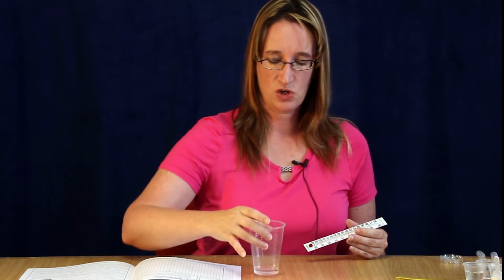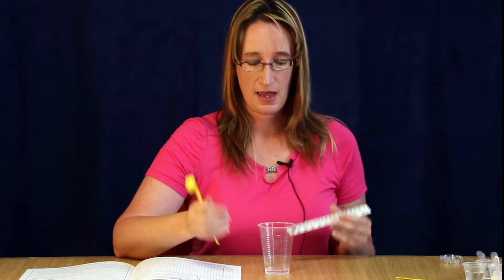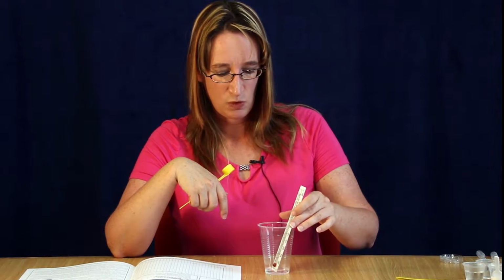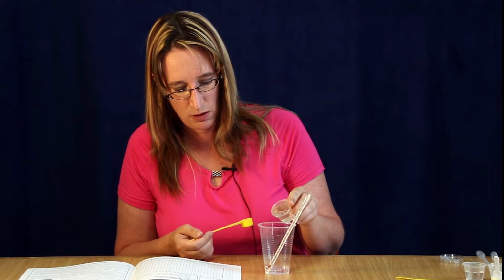I'm going to start with 3 scoops of the water, and the water is necessary just to raise the level of liquid in here so that the bottom of the thermometer is in the liquid and can record the temperature change, but the water doesn't really change the results from the reaction. You'll also, depending on your cup or the thermometer that you're using, you may need to add a little bit more water than that, and I'm going to add a little more water.